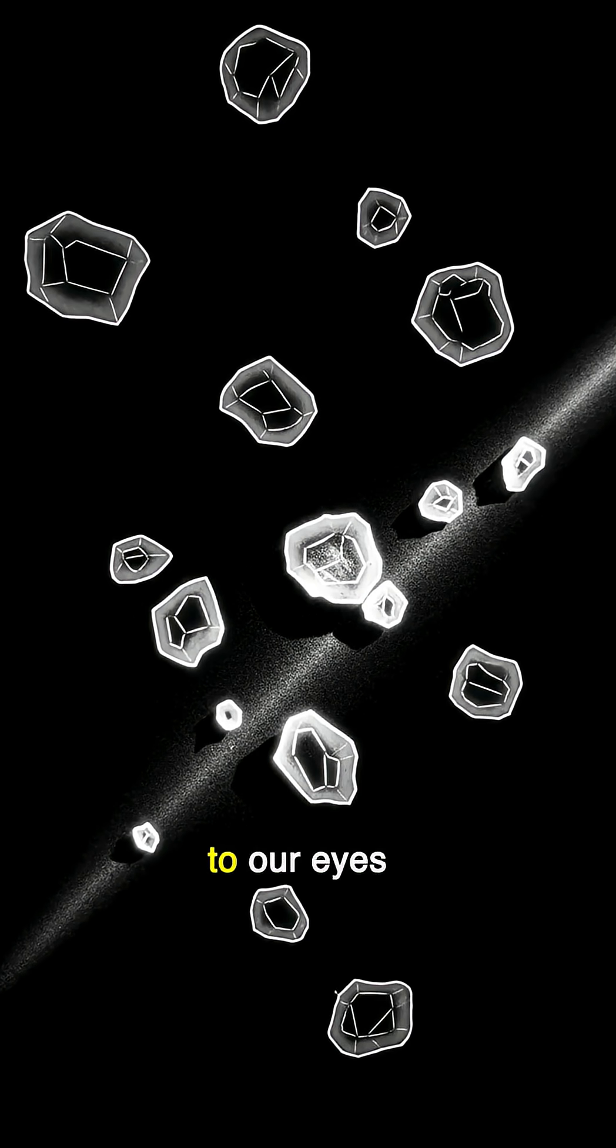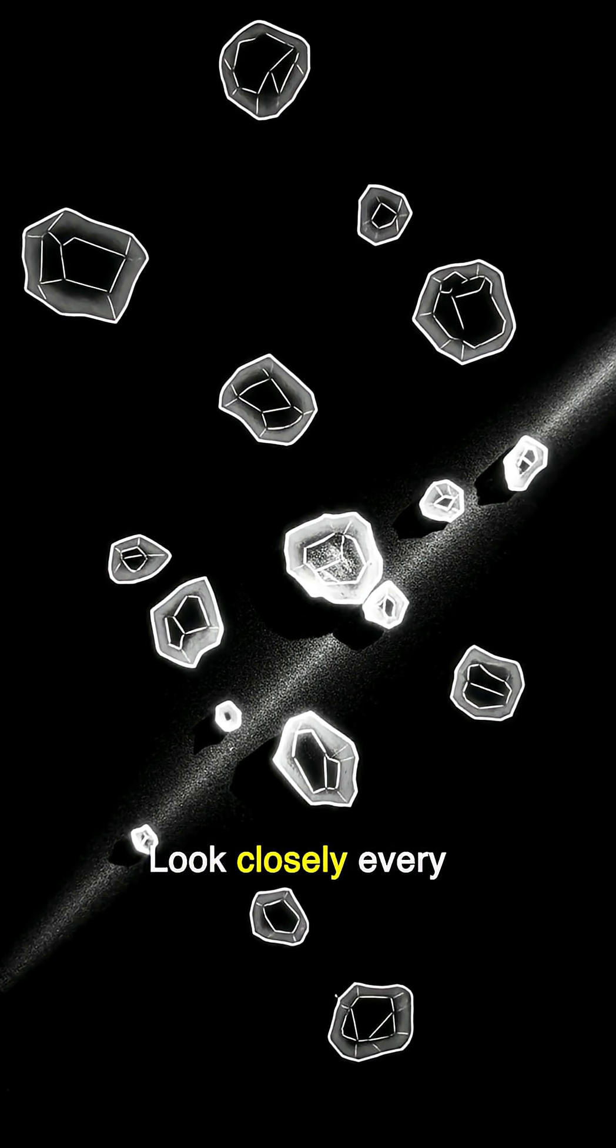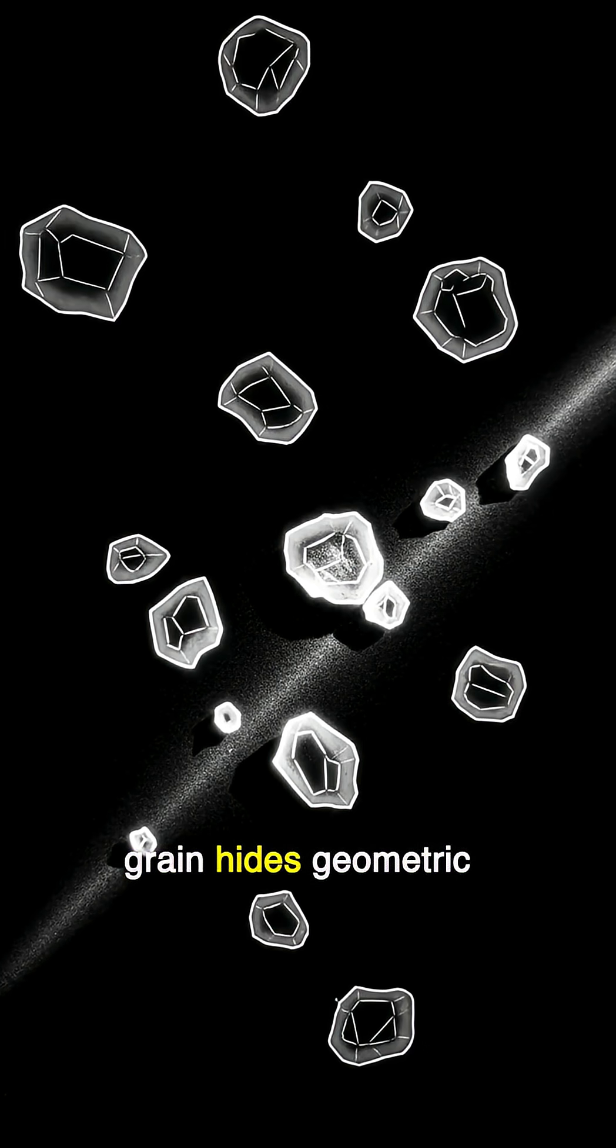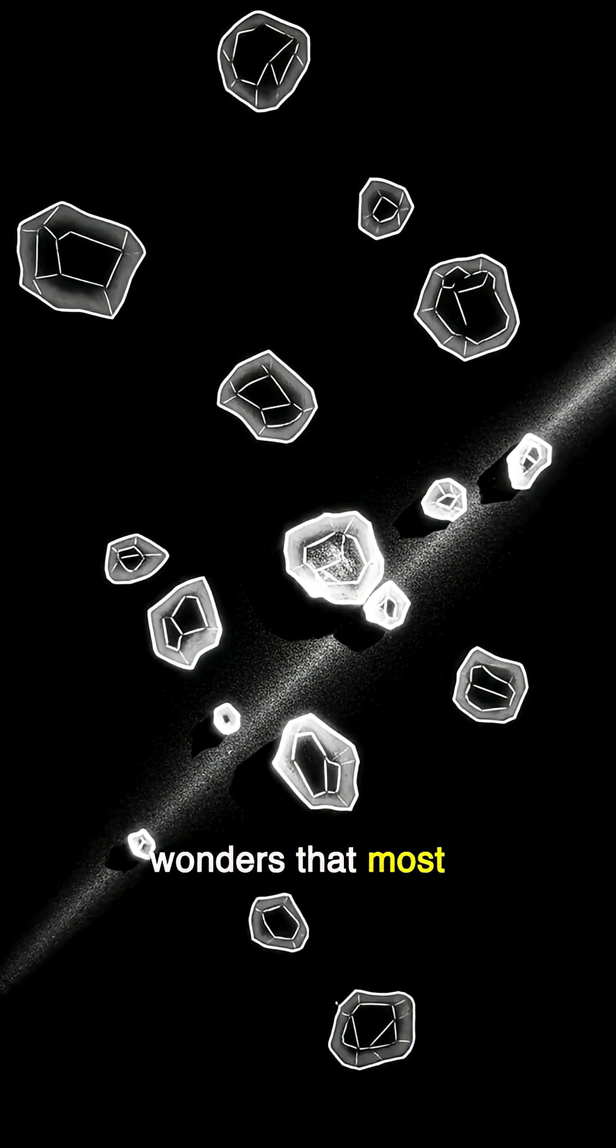Salt holds a secret world invisible to our eyes. Look closely. Every grain hides geometric wonders that most never see.